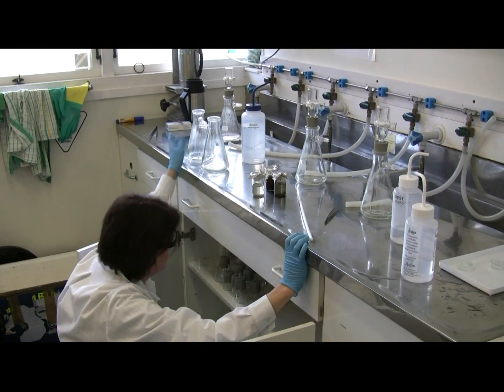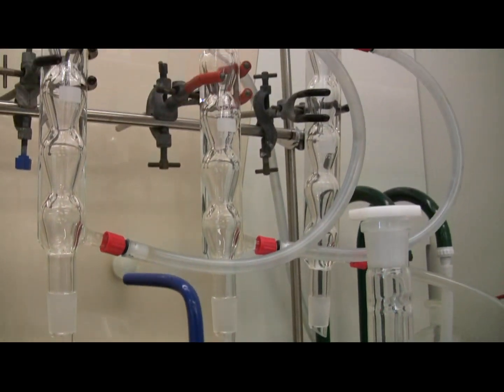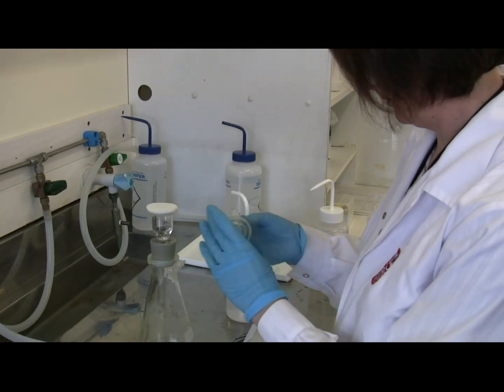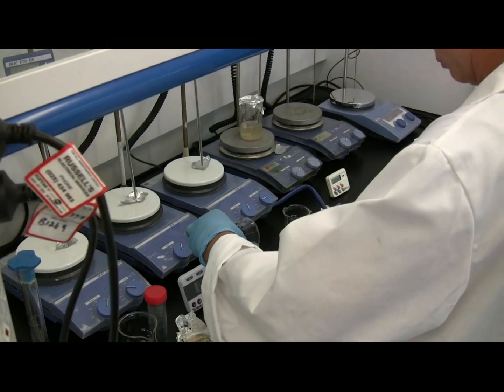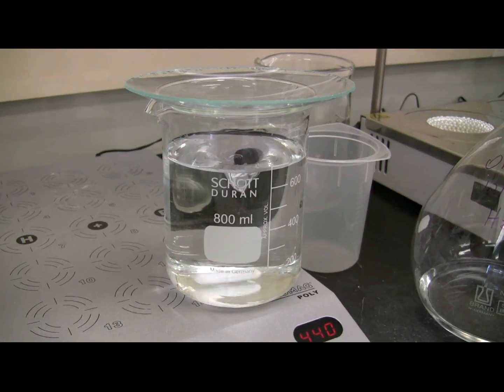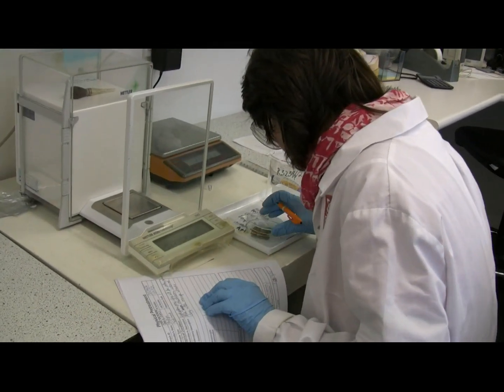The second step in the process is a chemical cleaning of the sample, because what we want to do is isolate carbon that is just from the sample and not from any external contaminating materials. So what you see here is people doing a lot of chemical processes to clean up the sample. In the textile example that we've been talking about, we're going to give it a series of washes with organic solvents, and those solvents will dissolve any greases or fats that have been attached to the sample by people handling it with their fingers.